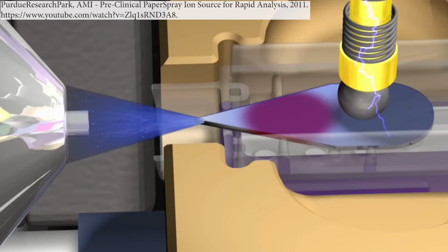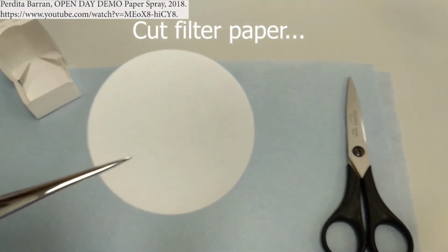You lose a little bit of sensitivity, but it's pretty remarkable how decent the sensitivity is for how little sample prep there is. You're just dropping blood onto a filter paper. So let's look at an actual paper spray experiment.